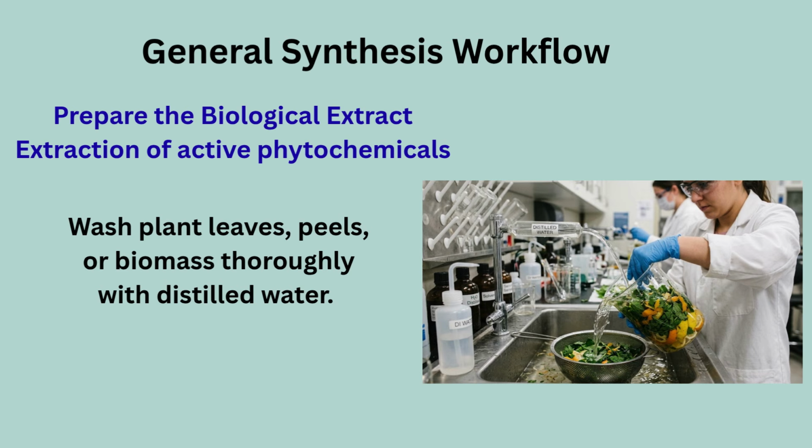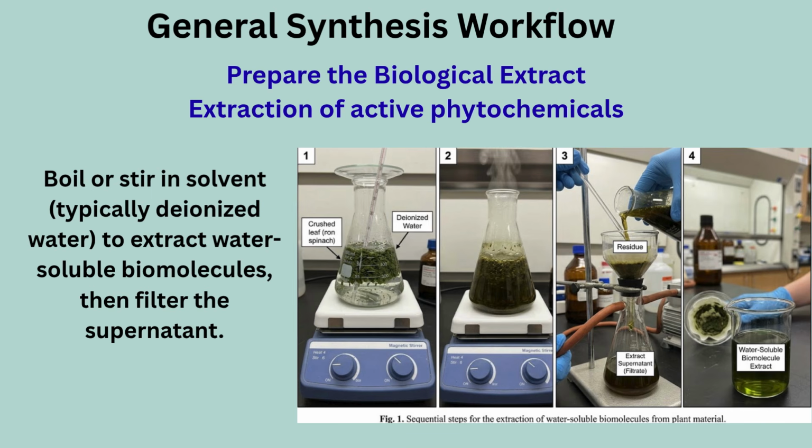Wash plant leaves, peels, or biomass thoroughly with distilled water. Boil or stir in solvent, typically deionized water, to extract water-soluble biomolecules, then filter the supernatant.